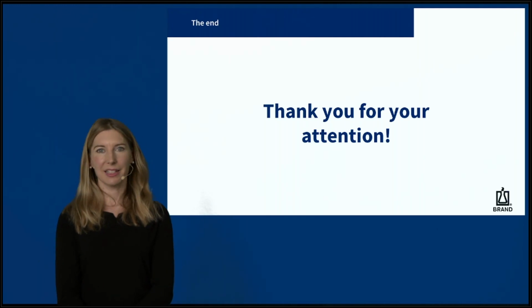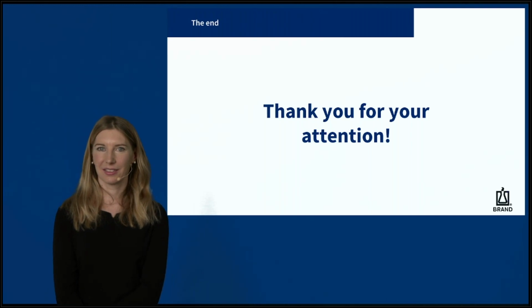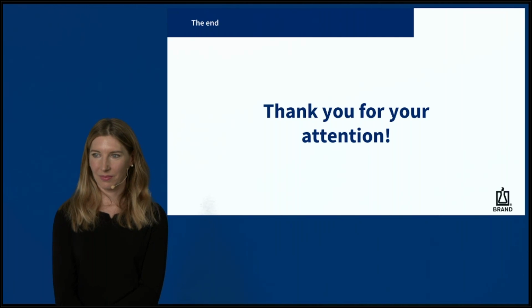So Benjamin, are there any questions available already? Yes, there is a question from Sarah. Hello, Mariella. For my pipettes, I use tips from other manufacturers. Does this have an impact on the accuracy?